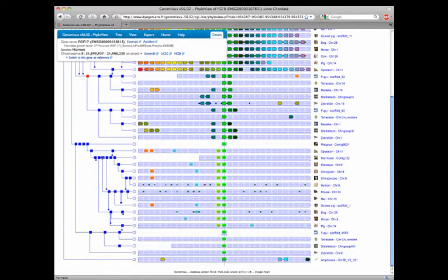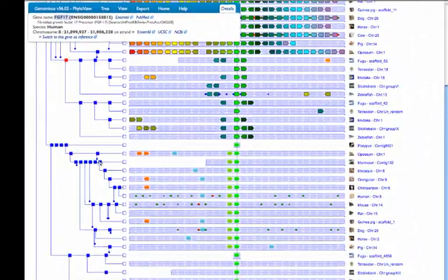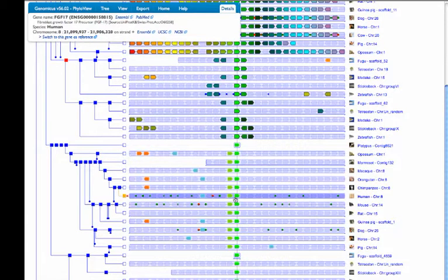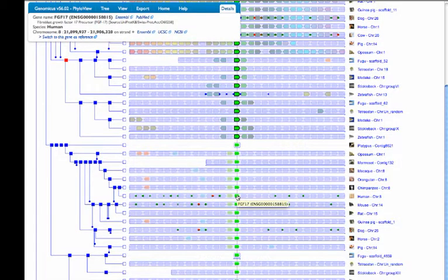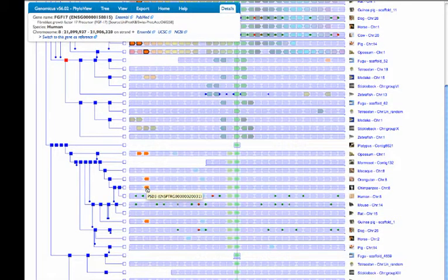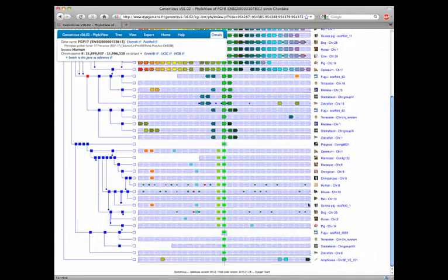I see that it is FGF17 to denote that it is a paralog of the query gene FGF8. The FGF17 gene is of the same green color, but surrounded with a white line as opposed to a black line, as for the fish orthologs. Interestingly, a few genes around FGF8 also have paralogs around FGF17, suggesting that the entire region containing an ancestral FGF gene actually duplicated to produce an FGF8 locus on chromosome 10 and an FGF17 locus on chromosome 8.